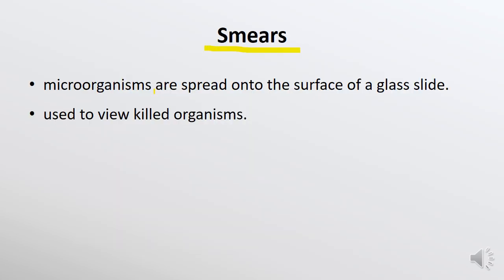So the last one is smears. Usually the microorganisms are spread onto the surface of a glass slide, and then it goes through the heat, in order to dry them as well as to kill them.